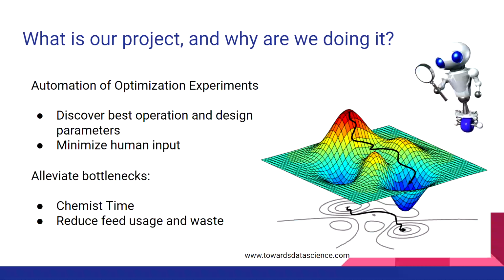The goal of our project is to automate the process of finding the most optimal way to run a particular reaction by inserting our product into the existing Boehringer Ingelheim lab setup. Optimizing a new process is expensive, both in terms of time and resources. A lot of this time is taken up by humans adjusting variables manually, be it temperature in a heat exchanger or the rate of certain pumps, which in many cases means stopping the process before restarting with the altered variable. This allows for a degree of human error, which can both interfere with the results and in some cases potentially lead to worker injury. By getting a computer to run this optimization on its own, we streamline this process and remove most of, if not all, cases of human error.